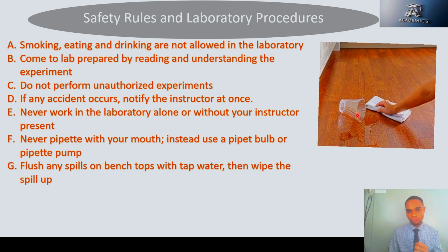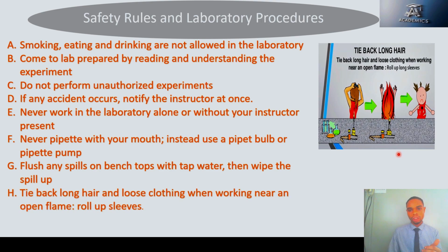If there's any spill on the floor, on the table, anywhere in the laboratory, make sure you clean it up immediately. And make sure you tie back any long hair, and do not wear loose clothing to the lab. This can mistakenly come in contact with open fire or dragging chemicals that will pour on your body. So you have to tie back your hair, and do not wear loose clothing to the lab. It is not advisable, in other words, to avoid any accident, please.